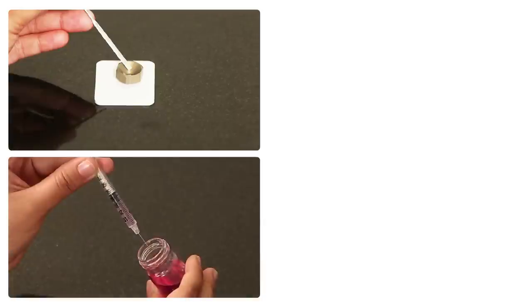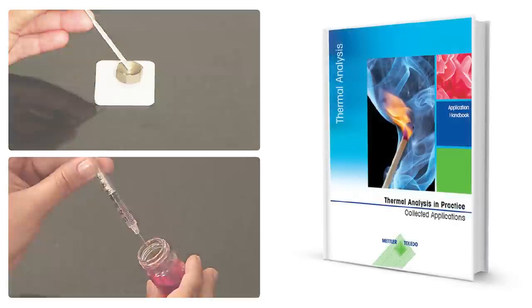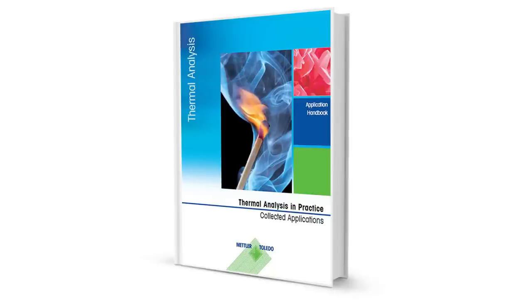You have seen how to prepare a powder and a liquid sample for DSC measurements. Further tips and hints can be found in the book Thermal Analysis in Practice.